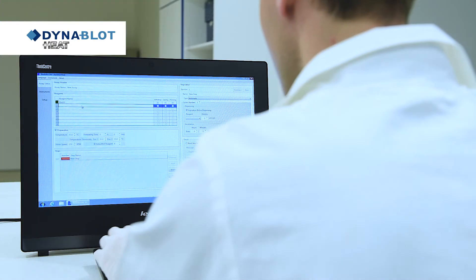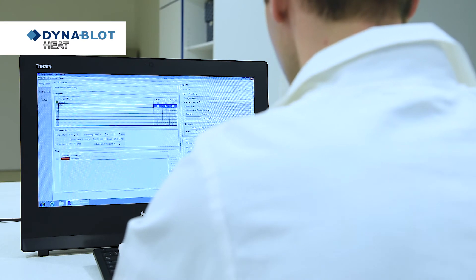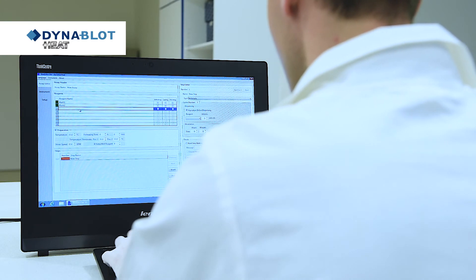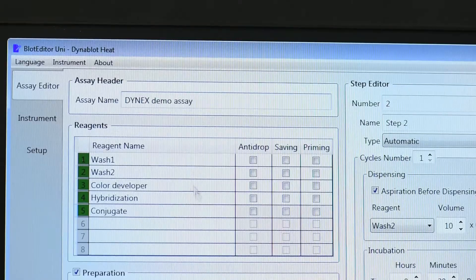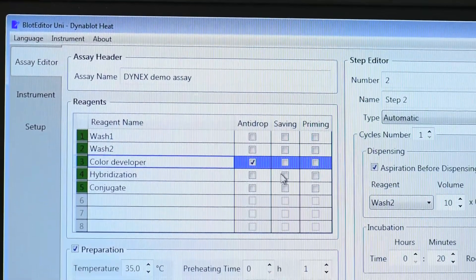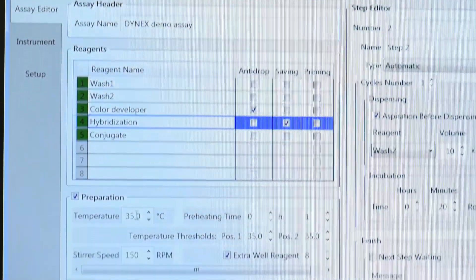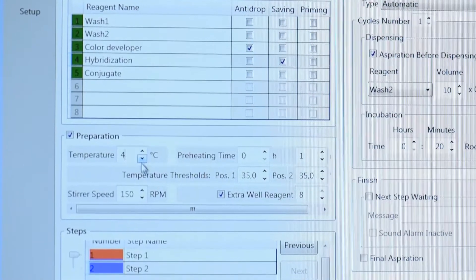Dynebolt Heat is an open platform. It is universal for any hybridization assay. Assay creation can be easily done by using any PC in the lab and our software. The instrument memory has 50 protocol positions.